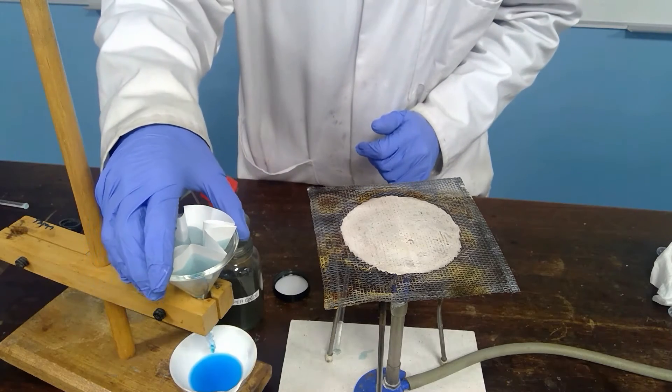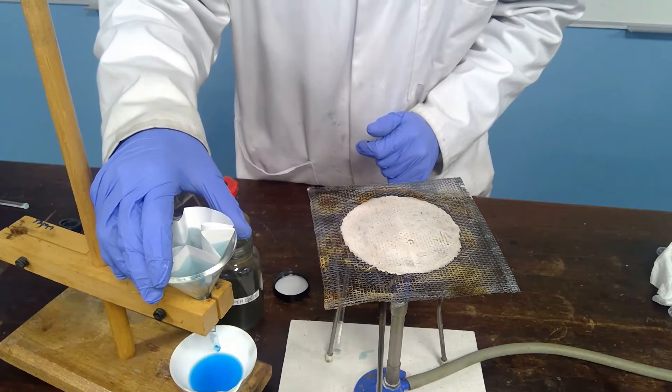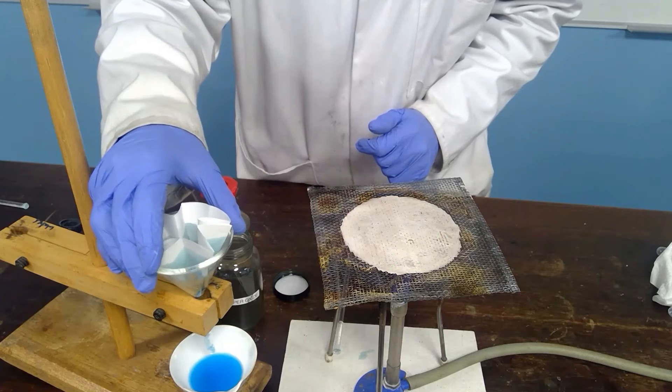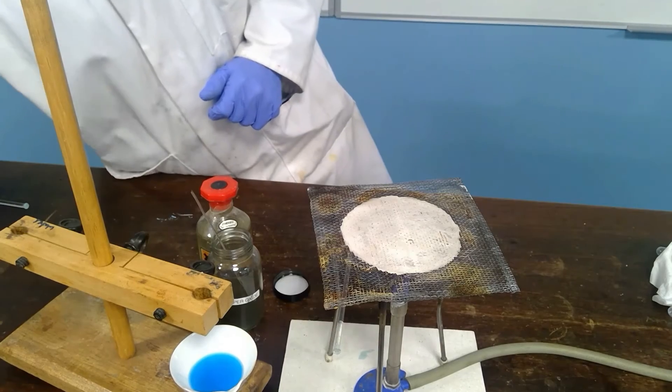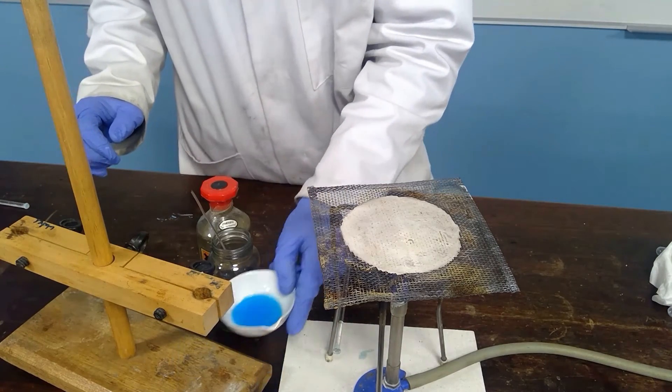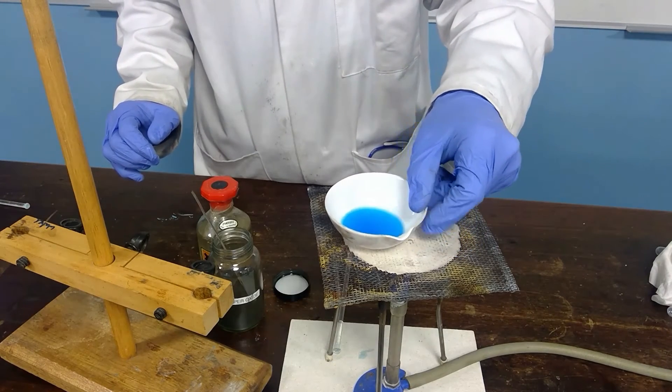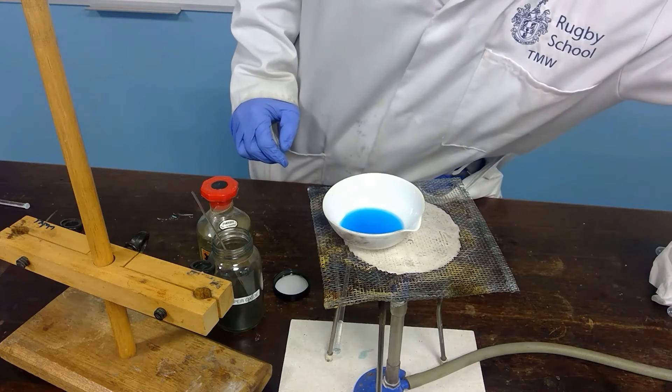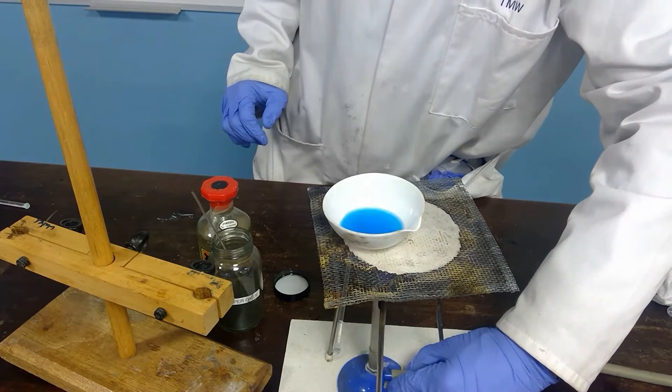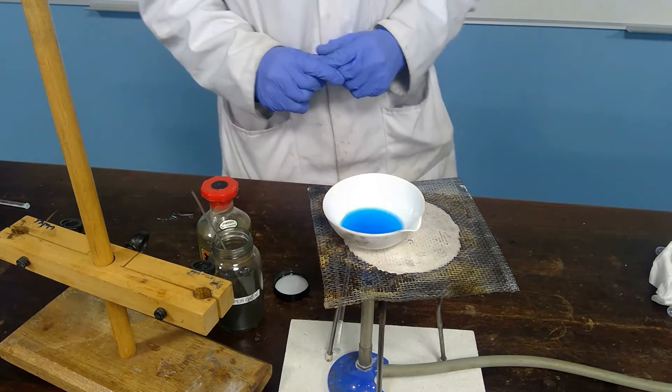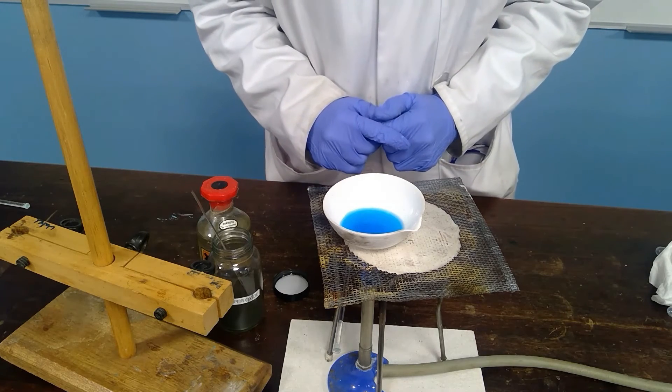But once you think you have sufficient of the blue solution, we need to effectively get rid of the water to leave us with the copper sulfate crystals. So we remove this at this stage. And we will place this back onto the Bunsen. So we just raise the temperature slightly again and we start to heat.